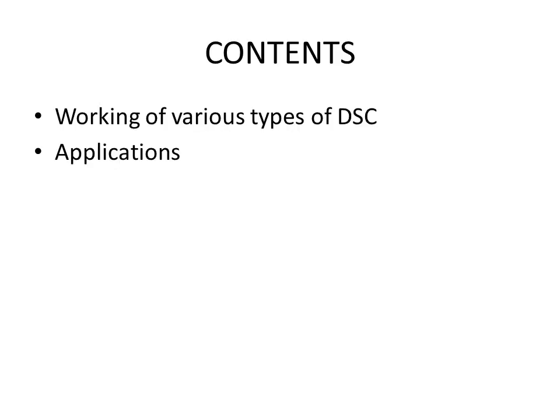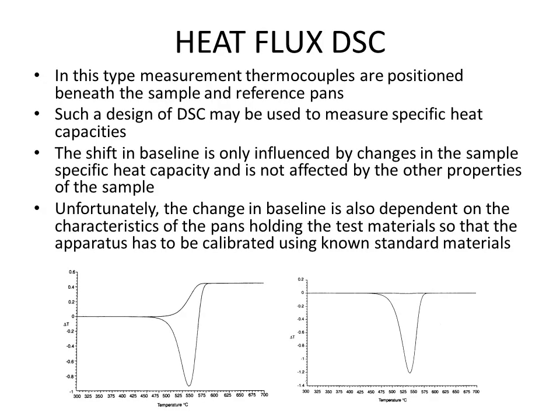And here are the contents of the current video. We'll see the working of various types of DSC. We have already seen the different types of DSC in part 1, so now we'll see their working. And then we'll see the various applications of DSC in detail. So first of all, we will see the heat flux DSC.